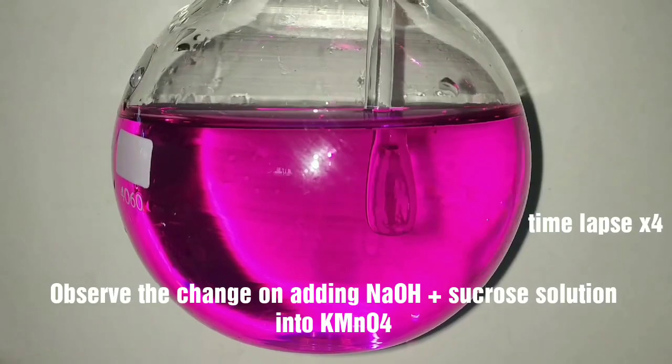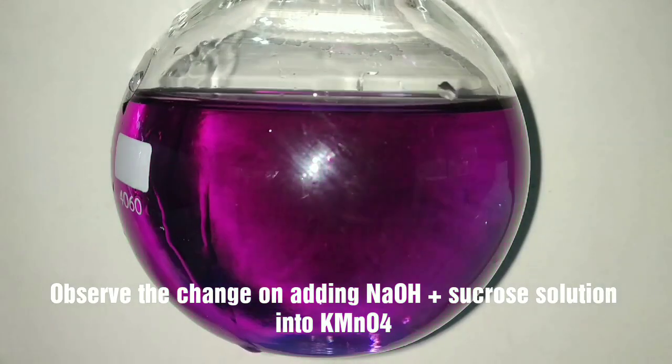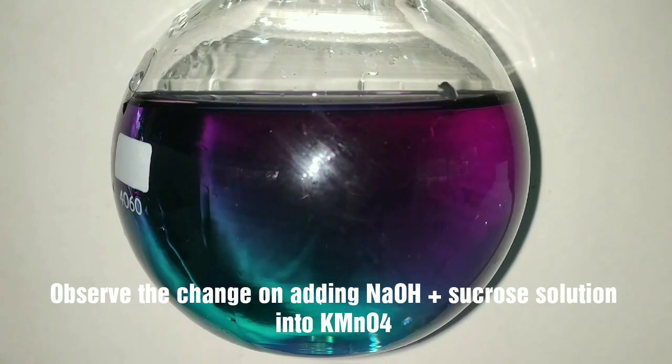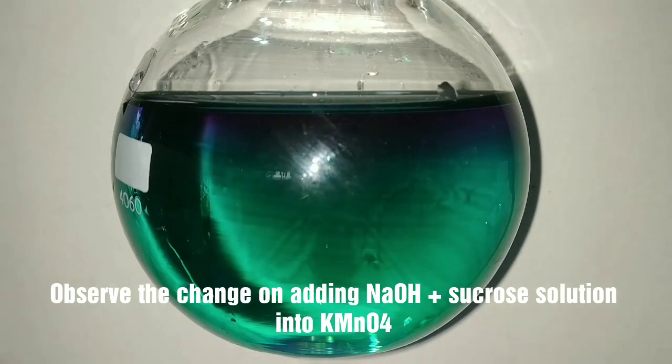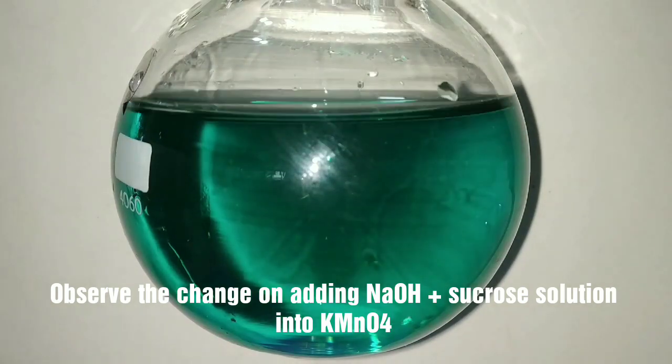Set up the flask containing the potassium permanganate solution, then add the sucrose and sodium hydroxide solution and stir. Observe the changes in color — initially the color turns blue and now it is turning into a green color.